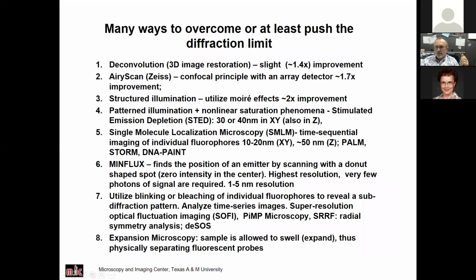So here's a question to my audience. Which technique do you think would be best for really thick samples? Anybody? Well, thick samples. Yeah, really thick. Let's say you're trying to image something at high resolution, and it's say 100 microns deep in your sample. I would think that Airyscan might be pretty good. Yeah, because it's a confocal principle, so you block the out of focus light, so you get a much better contrast. Okay, that's true, and it's on a similar level. It's also your STED microscope, because that's also based on the confocal system. Okay, thank you.